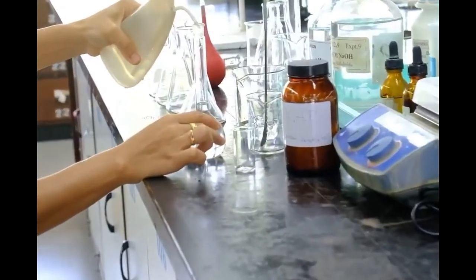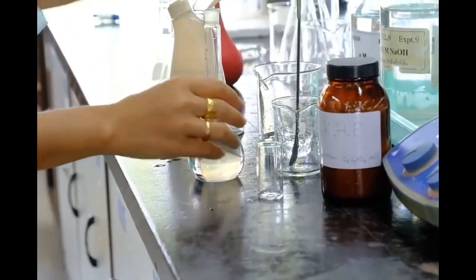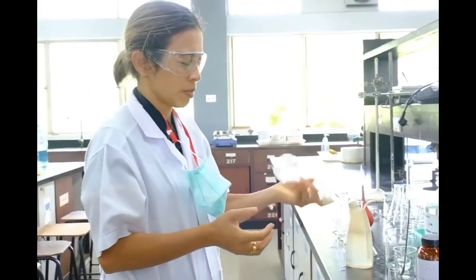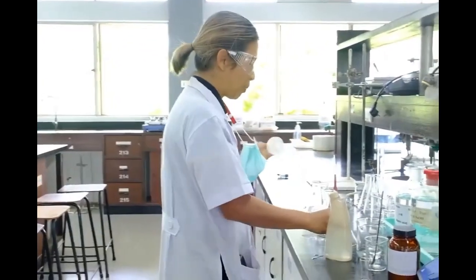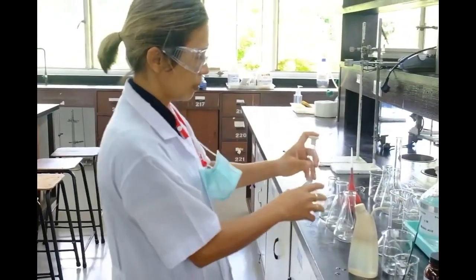Once you have the standard solution, pipette it.